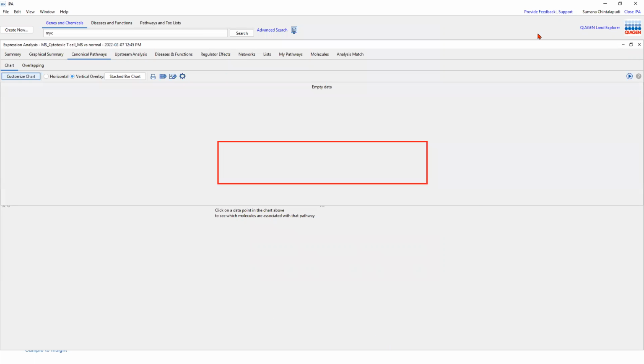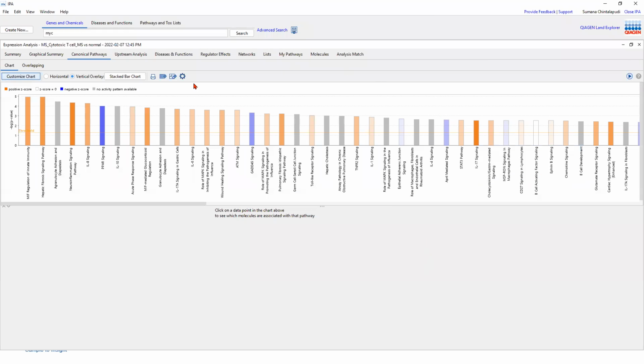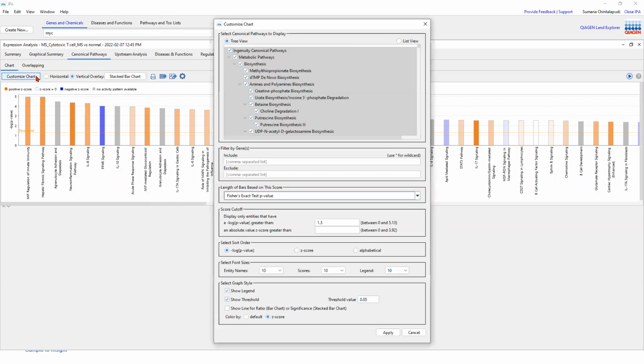If it isn't there, this is not going to report anything, but if this gene was present in some of the pathways, it's going to include that and just filter that list for you. So these are some of the ways you can change the information.